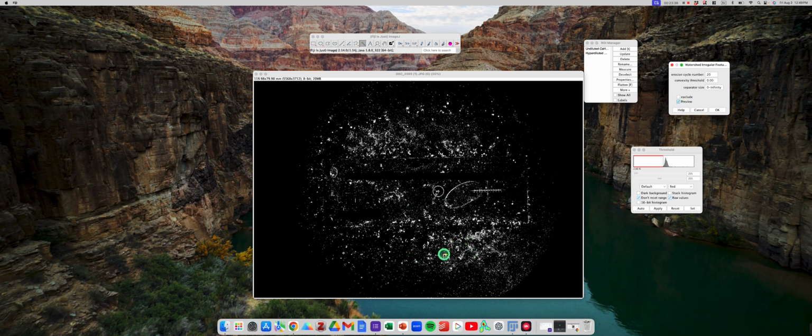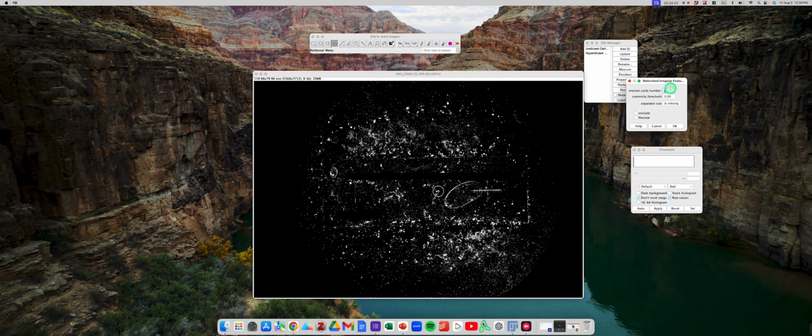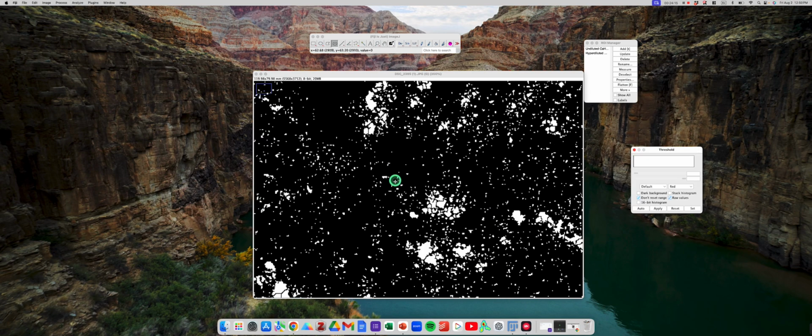Oh, make sure you can see I'm still highlighting only this tiny piece. We want to click out of this and make sure that we're not just measuring that one. So just click any of these shape tools, click outside of the wand, highlight, and then redo this. Or else it will only apply the watershed to the area that you've selected. So we'll do 20. You can preview it or not. Let's zoom in and take a look. Click OK. So now it's broken these things up.